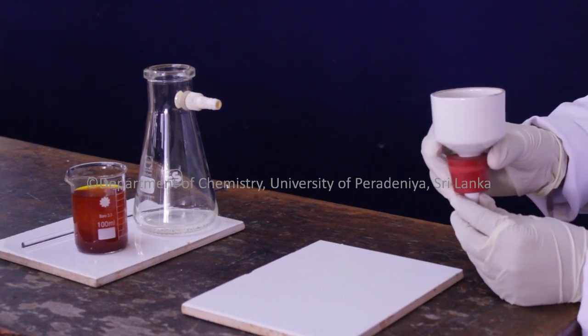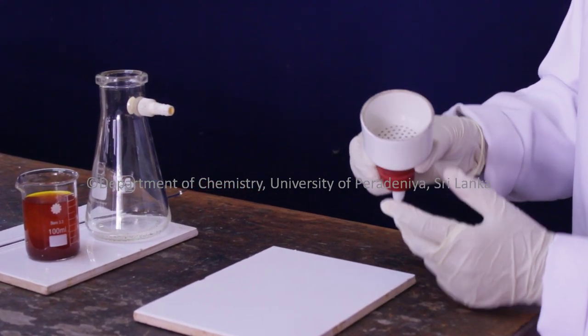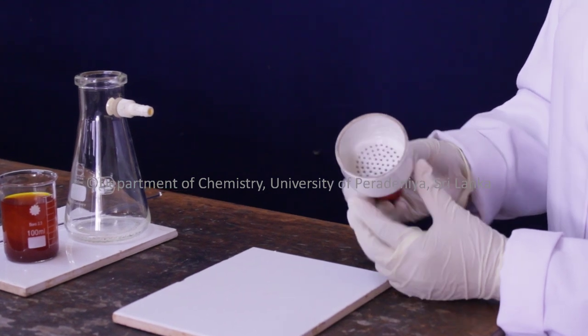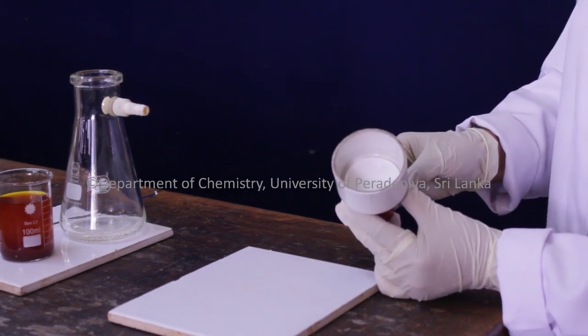The funnel is usually made of porcelain, with a cylindrical chamber above a funnel. There are small perforations between the two. We need to keep a filter paper on top of this porous plate before doing the filtration process.